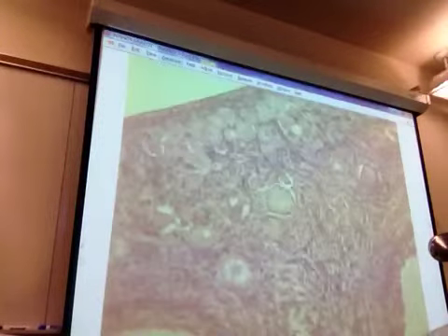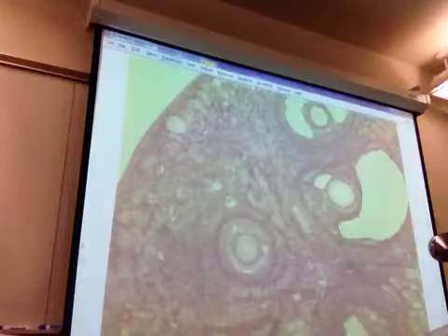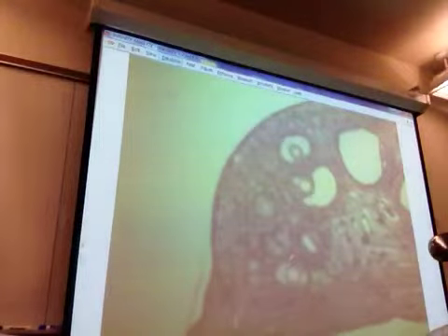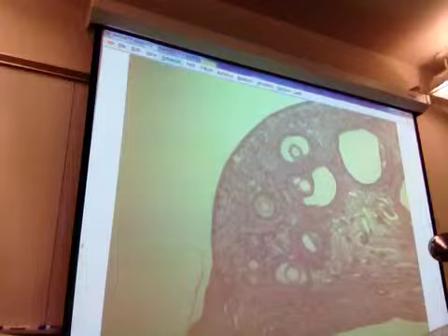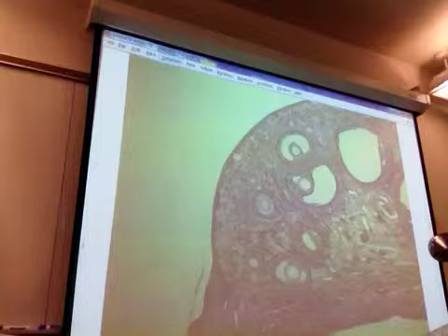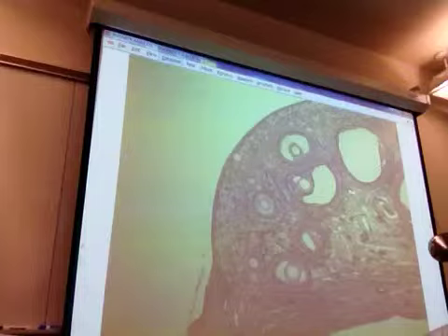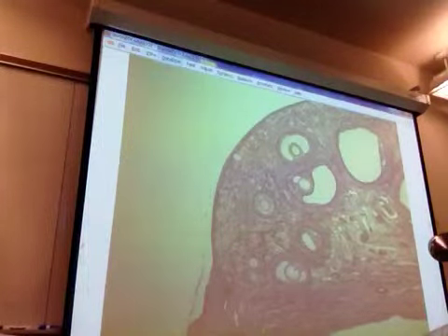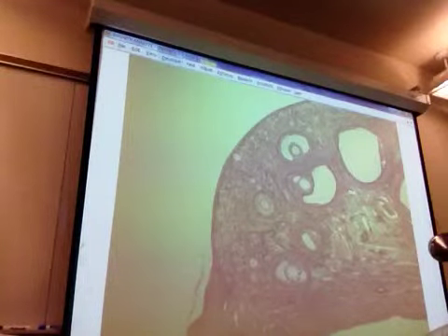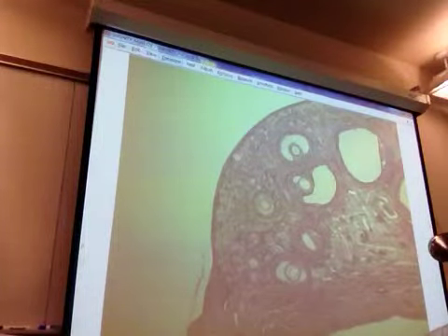Okay. So, what is this? Is that an ovary? It is an ovary. Give them all. So what is this? That's a tertiary follicle. What is this? Secondary. What is this nice big thick pink ring? Zona pellucida. What is this? These cells. The corona radiata. We're doing it well. So right down here, corona radiata.